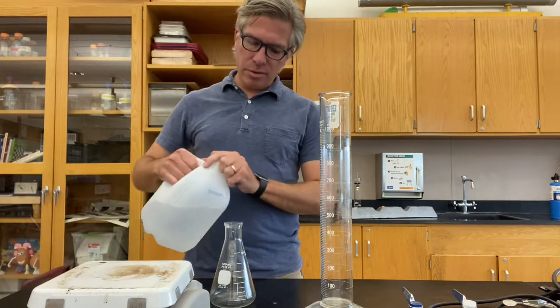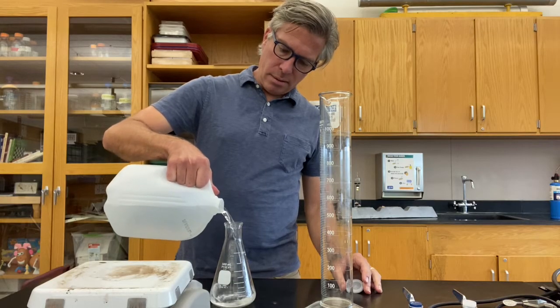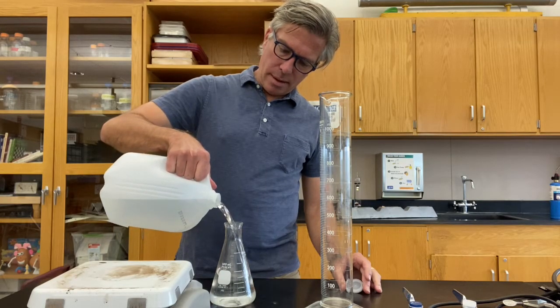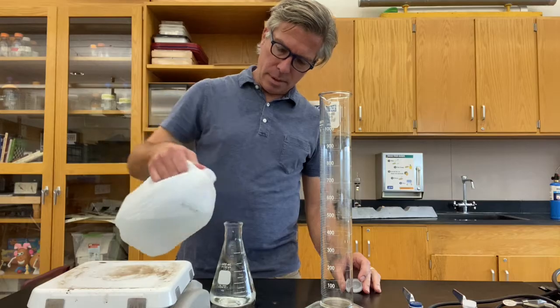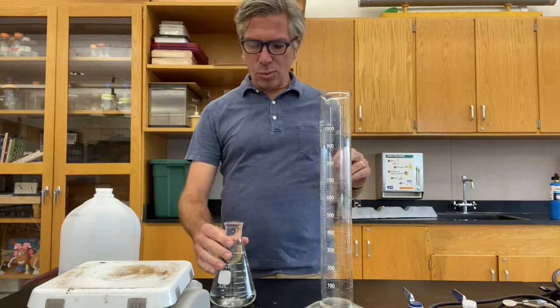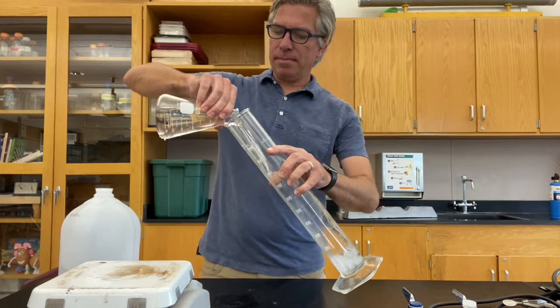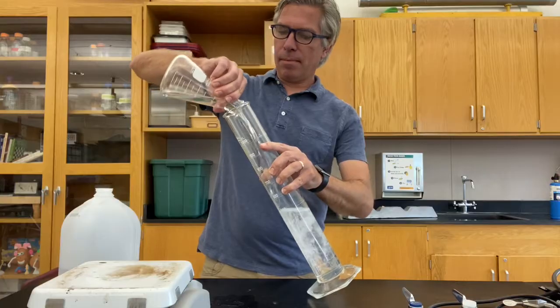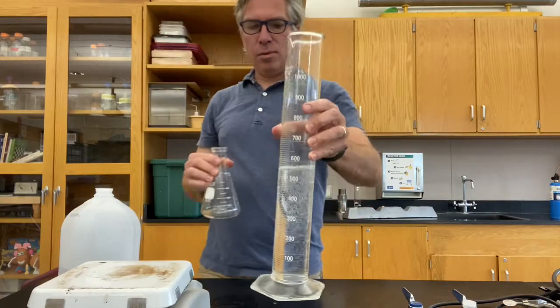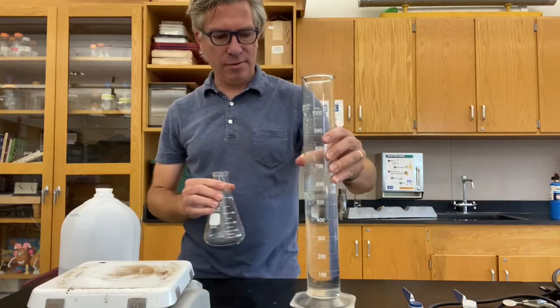The easiest way to do that is to fill it up with water all the way to the top. Even make a little mess if you want. And then take this water and pour it into a very large graduated cylinder, which you can then use to measure the volume of the liquid that fits inside of the flask.